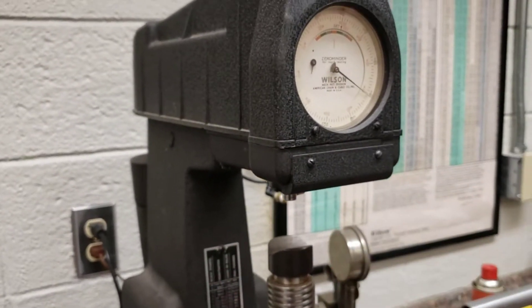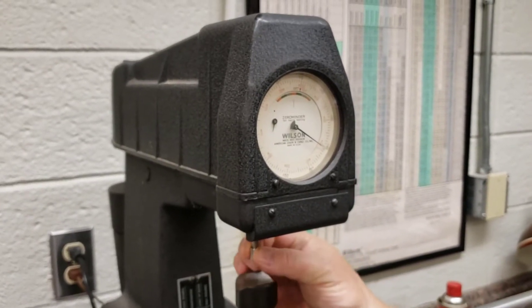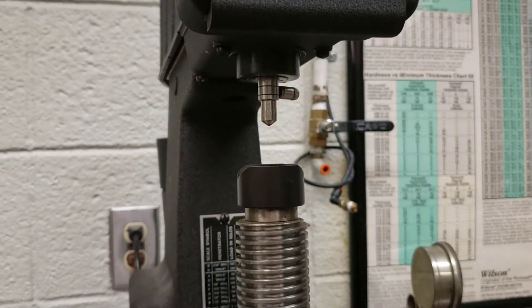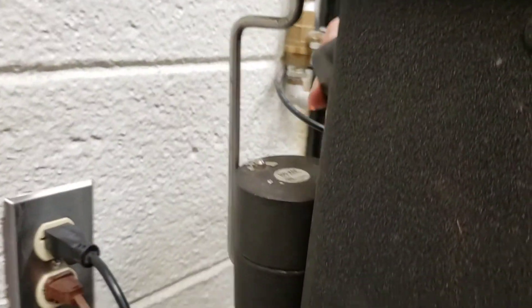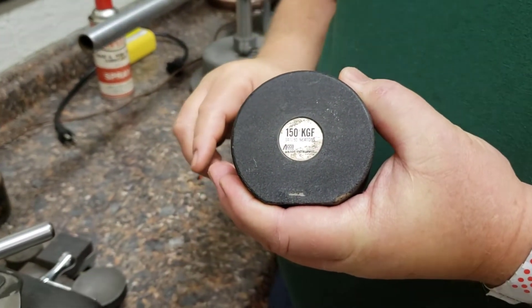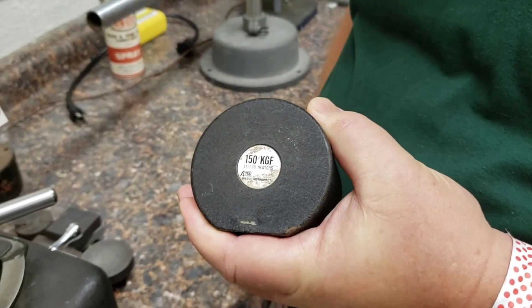How do you set the load on this manual machine? It's a little different than the electric. First, mount the Brale. Behind here you can see the weights. For 150 kilograms, we put all three weights on. If we need just 100, we take off the top one — you can see it says 100. If I only need 60, I take off the second one and it says 60.